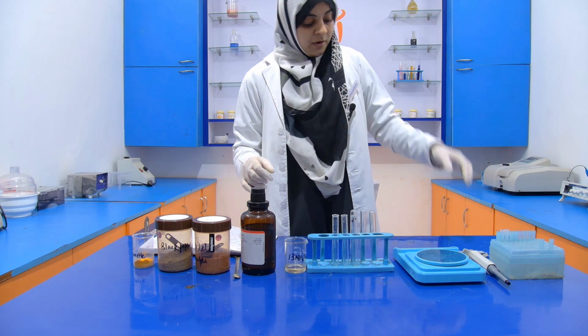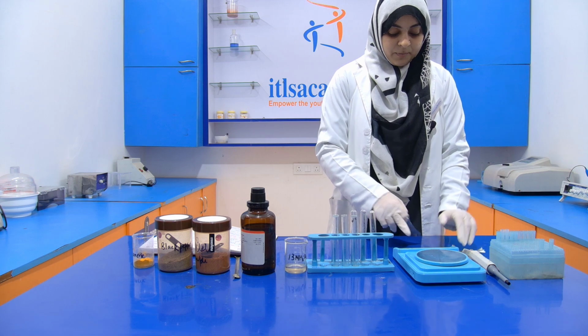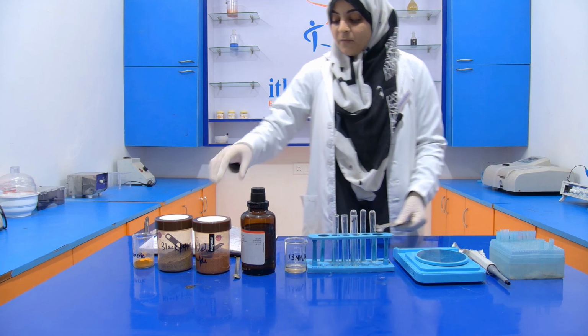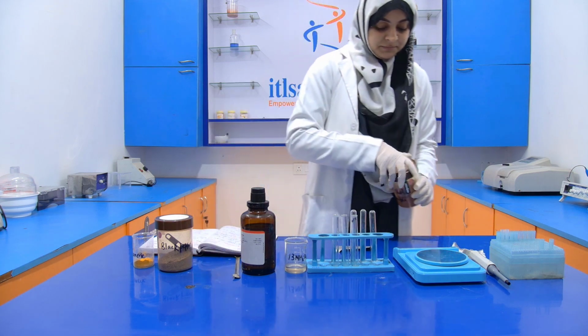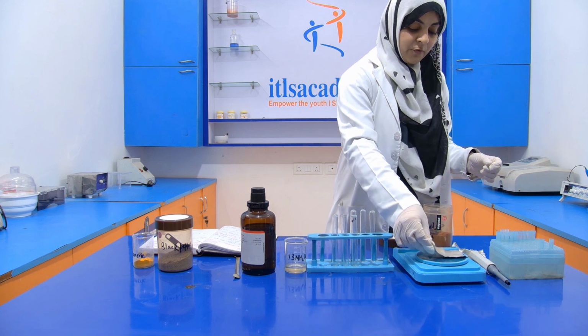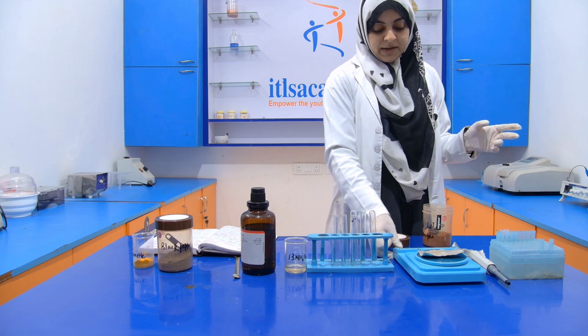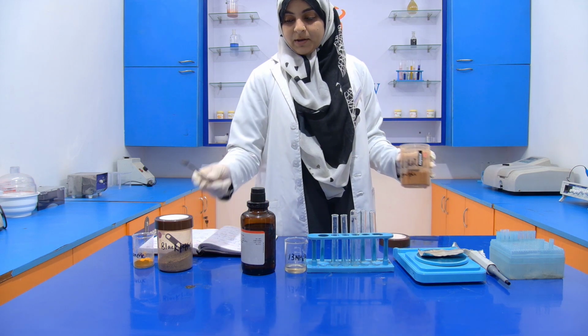Now first of all, we have to weigh the sample with the help of the weighing balance. First take the red chili powder. Now put the aluminum foil onto the weighing balance and don't forget to tare the weight of the aluminum foil.